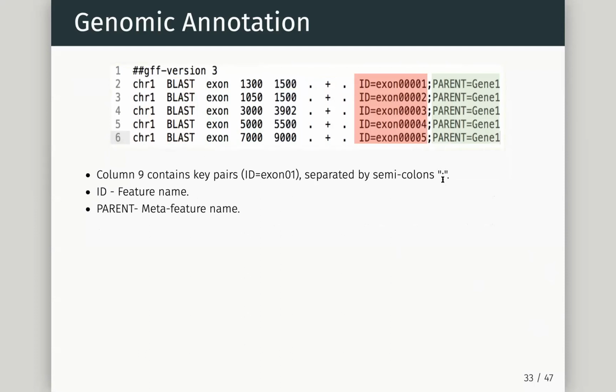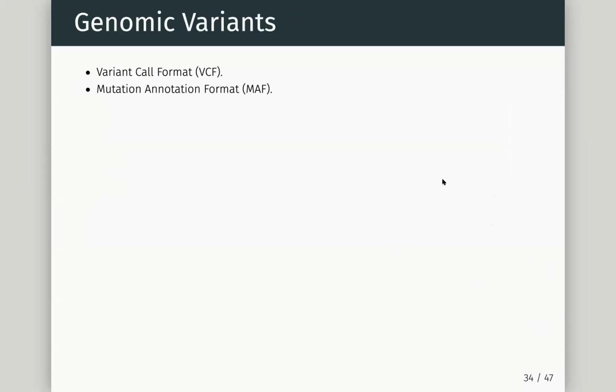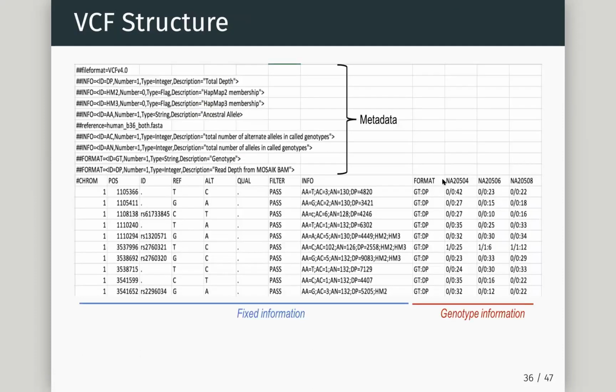but GFFs are recognized now as a format, and when we pass files to software, we've got software waiting for GFF files. So we have to follow the trends in a way, and these are the types of files we're going to see a lot of. Okay, so that was VCF, and just to reiterate: chromosome, start position, an ID. It's very similar to BED, but now really tailored for variant information. Strip out what you don't need and leave in what you do need. Most importantly, VCFs are expected to have this metadata at the beginning, so that anyone who comes to it can have the expectation that I can explain what all these columns mean.